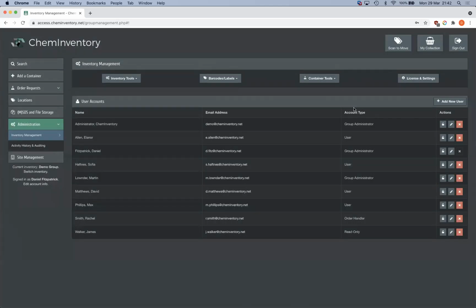If you do delete your entire inventory accidentally, say in a few months' time, we can reverse things from our end if need be. So if an administrator accidentally empties out your inventory, that can be reversed if need be. But it's also a useful tool if you notice during your initial import that something may have been wrong. So yeah, that's the steps that I recommend you follow.